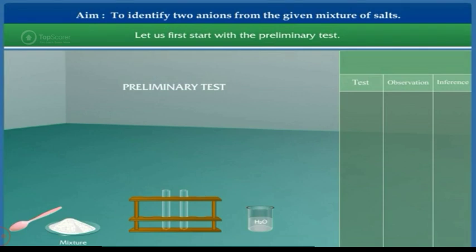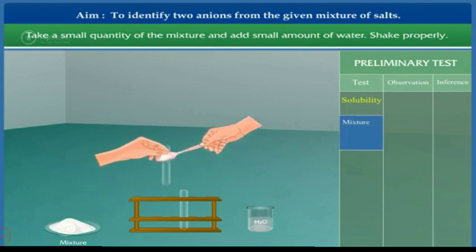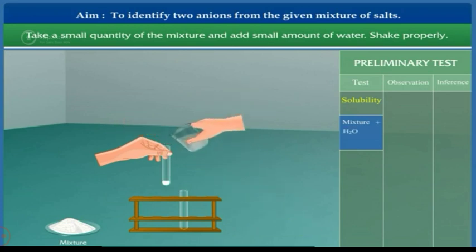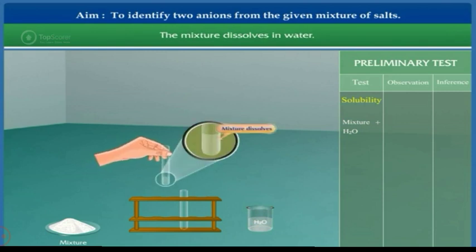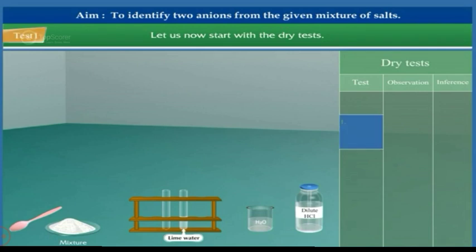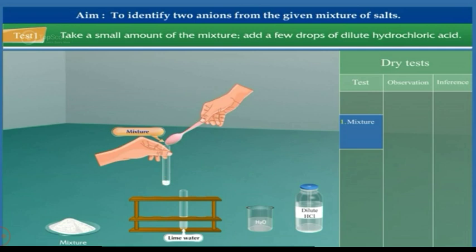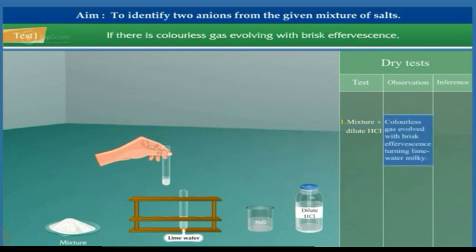Let us first start with the preliminary test — Test of solubility. Take a small quantity of the mixture and add a small amount of water. The mixture dissolves in water. This shows that water-soluble carbonate, chloride, bromide, iodide, nitrate, or sulfate may be present. Let us now start with the dry test. Test 1: Take a small amount of the mixture and add a few drops of dilute hydrochloric acid. If there is a colorless gas evolving with brisk effervescence, allow it to react with lime water.